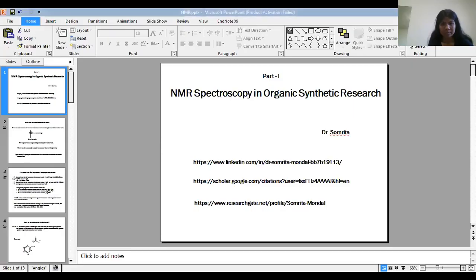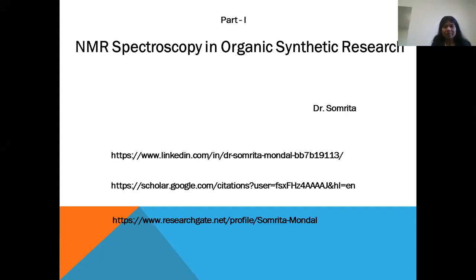Let me share the screen. I hope you can see the screen now.